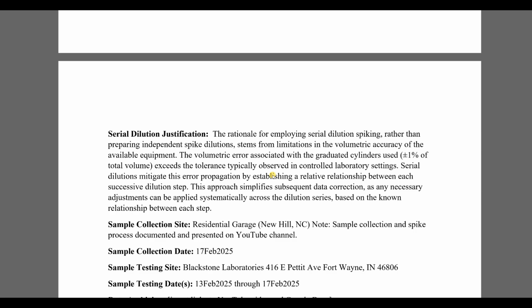But for this study, it was okay because, again, this is a proof of concept. And also, if there are any defects in their volumetric markings, the serial dilutions could be much more easily accounted for, based on each dilution having a relationship to one another. So that's the reason why I've done a serial dilution. Technically, to be much more thorough, you would prepare everything independently. And there are other scientific justifications for doing that that we're not going to really get into. But I'll just say, for this right here, this is perfectly fine. And that's what we rolled with.